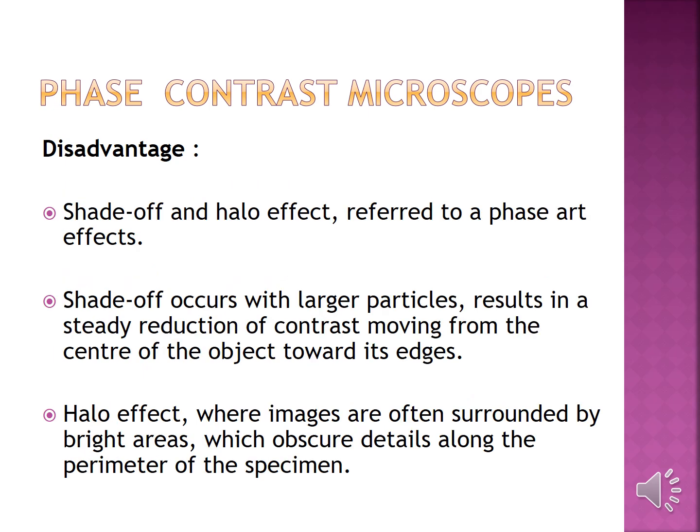Shade-off and halo effect refer to the phase artifacts. Shade-off, occurring with larger particles, results in a steady reduction in the contrast moving from the center to the edges. Halo effect, in which images are surrounded by bright areas, obscures detail along the perimeter of the specimen.